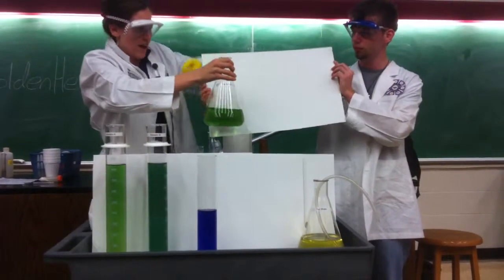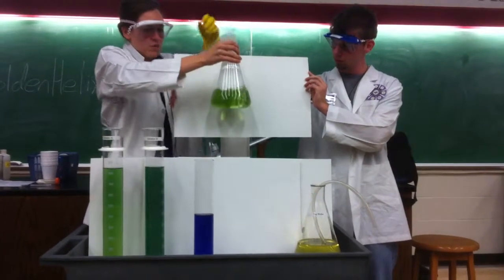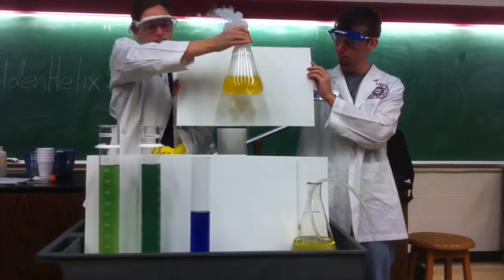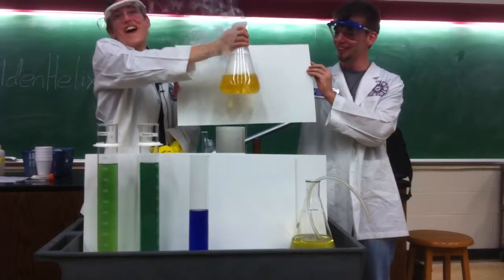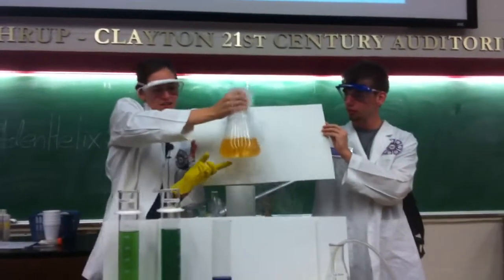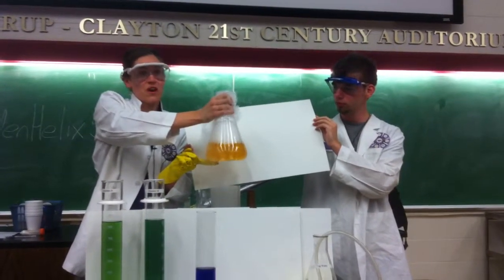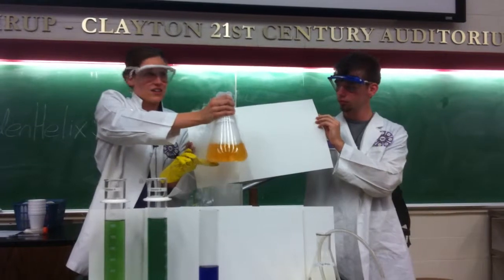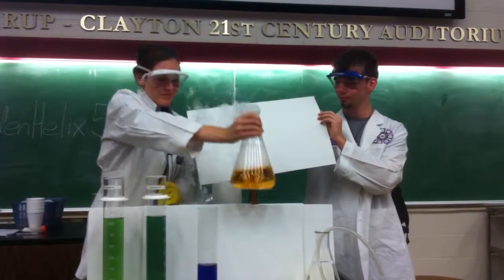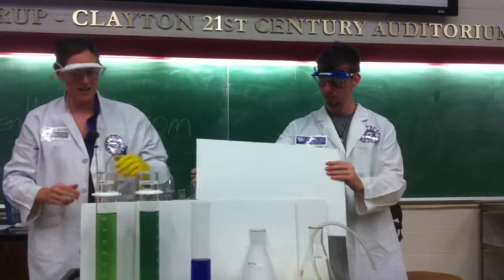I'm going to add some dry ice to our tap water, and what do we observe? Fun. Yeah, that's the water vapor condensing above. And what's happened is the carbon dioxide reacts with the water to form carbonic acid. The pH drops. We observe a color change with our universal indicator.